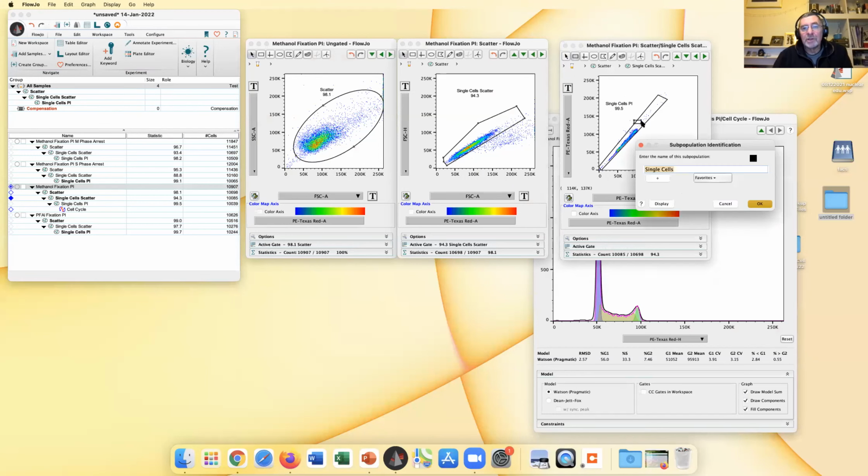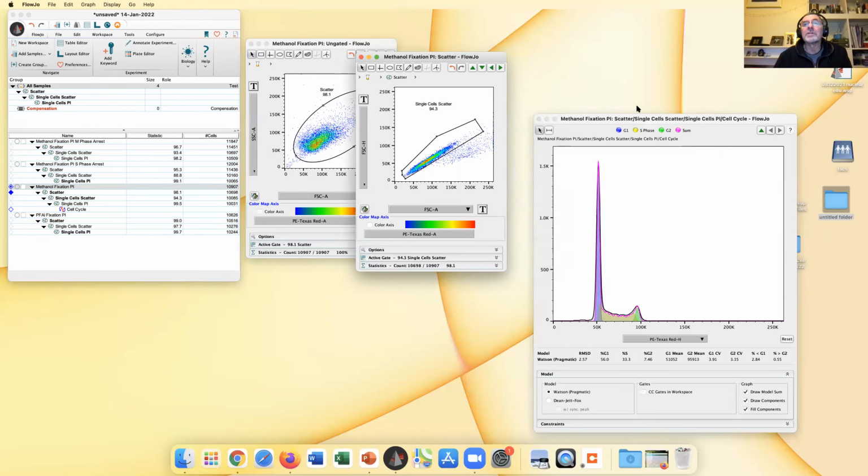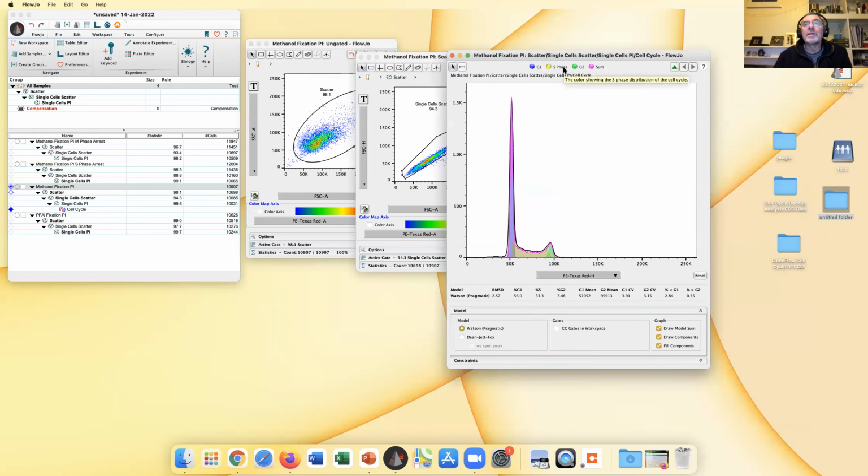Yeah. And sometimes the further you get away from a classical G1, S, G2, the harder the model has to fight to look at that. There's another question about deciding where the apoptotic cells are when you're analyzing the cell cycle. If you're just looking at DNA analysis, that can be quite difficult.